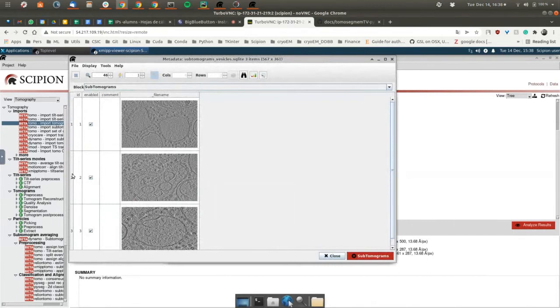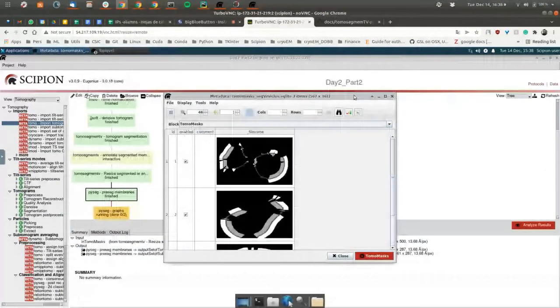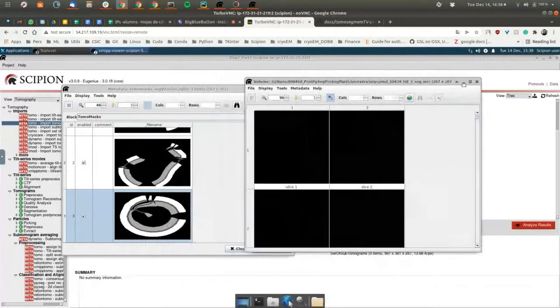I only know a few of the basic usages, like the profile, because I think it's very useful when analyzing sizes.